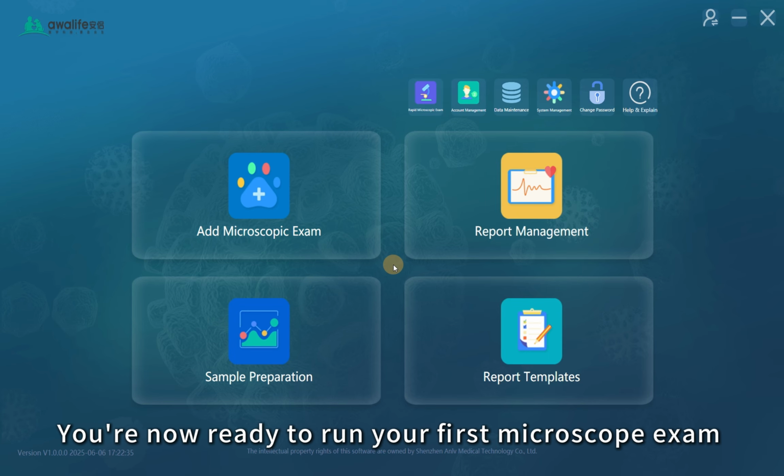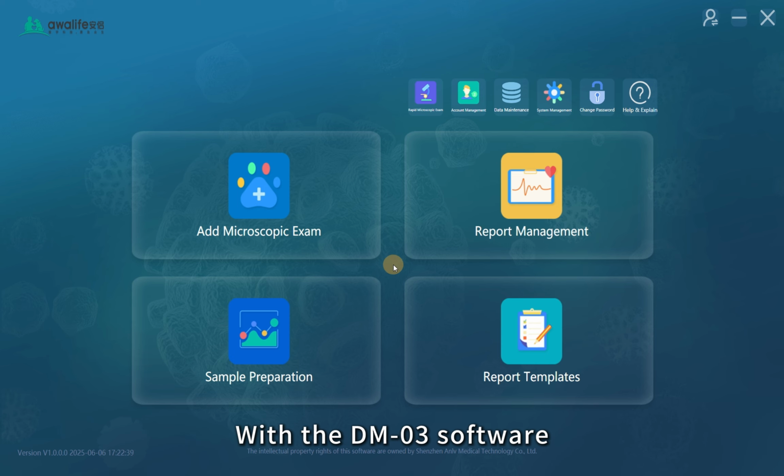And there you go. You are now ready to run your first microscope exam with the DM-03 software. In the next chapter, we will dive into managing reports and customizing templates. See you there!